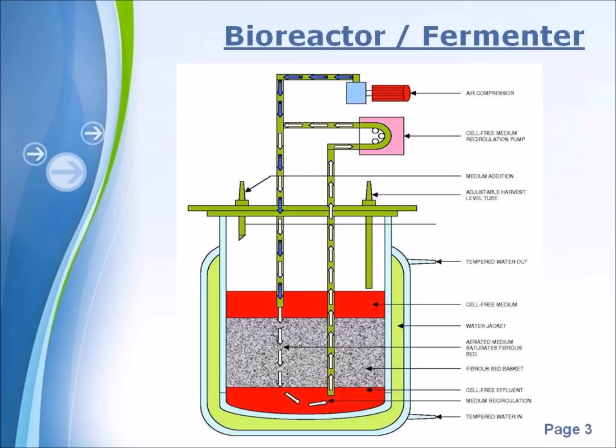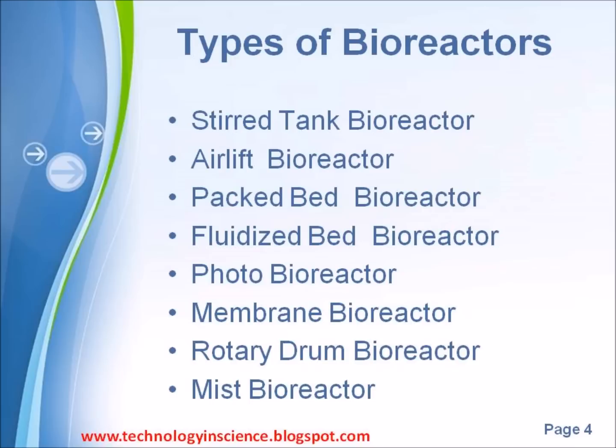cells. Different types of bioreactors are stirred tank bioreactor, airlift bioreactor, fluidized bed bioreactor, packed bed bioreactor, photobioreactor, membrane bioreactor, rotary drum bioreactor, and mist bioreactor.